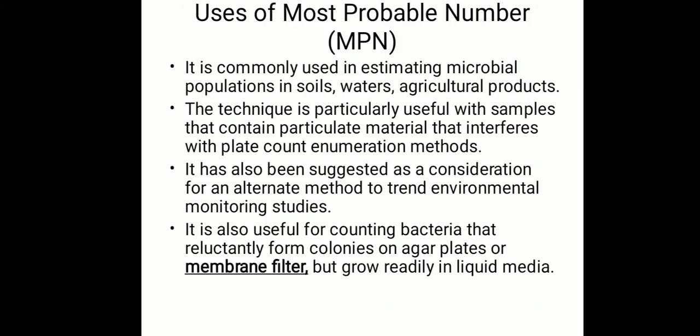So what are the uses of this MPN, or most probable number? It is commonly used in estimating microbial population in soil, waters, agricultural products and some other samples as well.